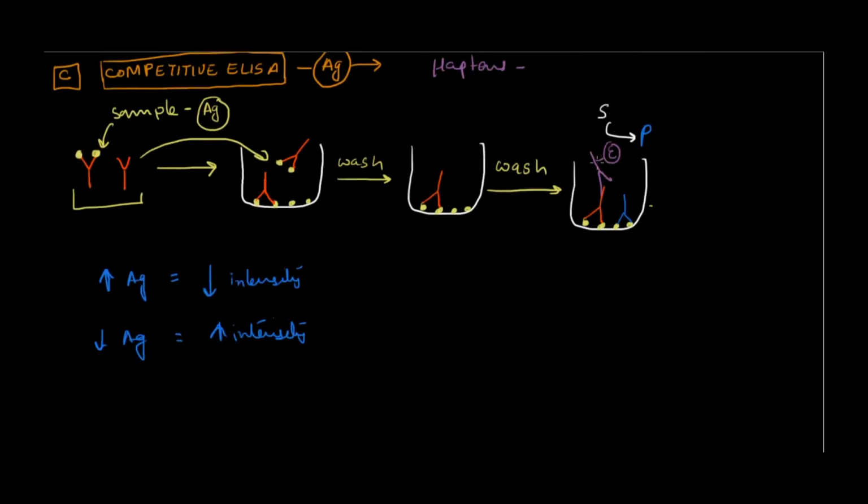advantage of using this secondary antibody conjugated with enzyme is, when we talk about the secondary antibodies, they can bind to any type of primary antibodies. Okay, a large number of primary antibodies, it can bind to the Fc region of any type of primary antibody. So one set of secondary antibodies that I have conjugated with enzyme can bind with any type of primary antibodies.